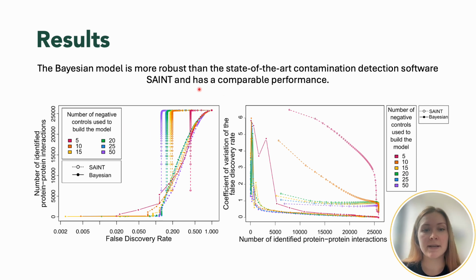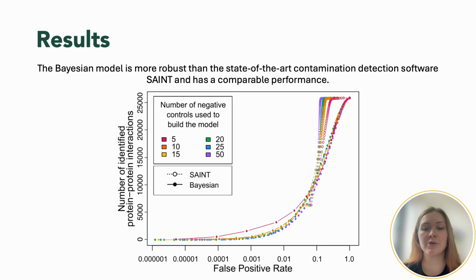And so what you may notice is that SAINT quickly hits a lower wall in the estimated false discovery rate, and it also has higher variation across replicates. So overall, this suggests that the false discovery rate is not well estimated with SAINT, and therefore not as informative for evaluating performance. And so we looked at a similar metric of false positive rate, which also reflects for us the proportions of false positive identifications. And here, both models identify a similar number of interactions at lower biologically relevant false positive rates. And additionally, the Bayesian models can achieve lower and more stringent false positive rates than SAINT.